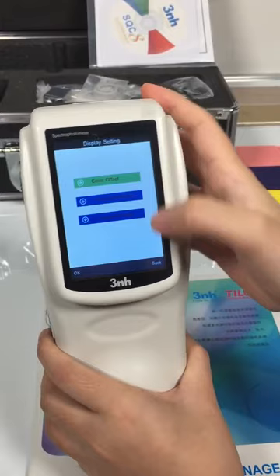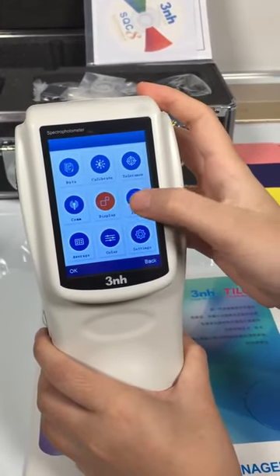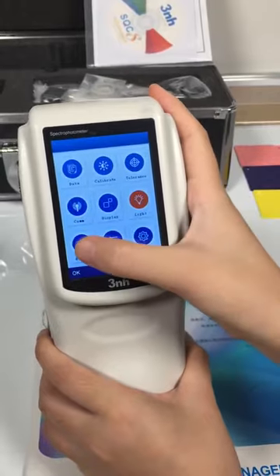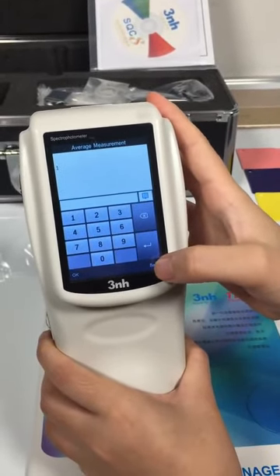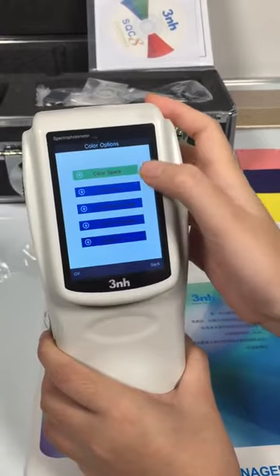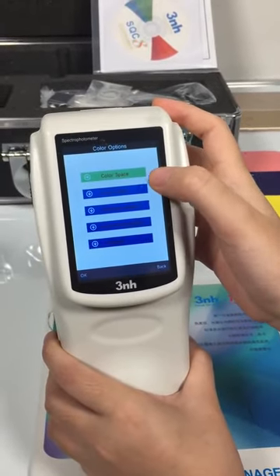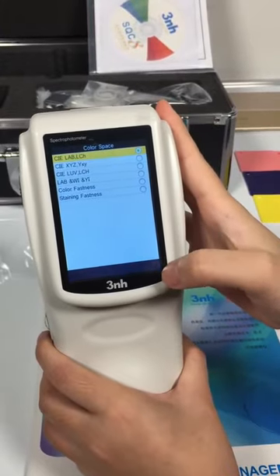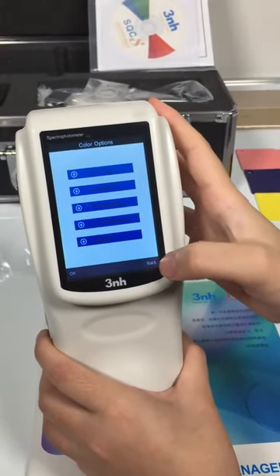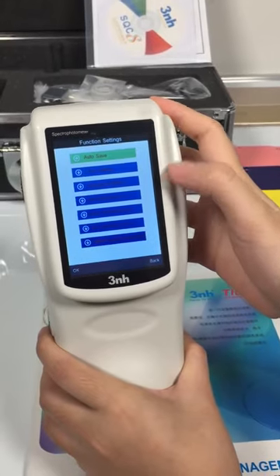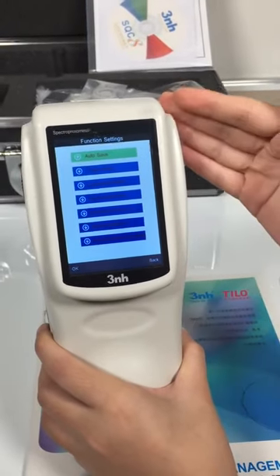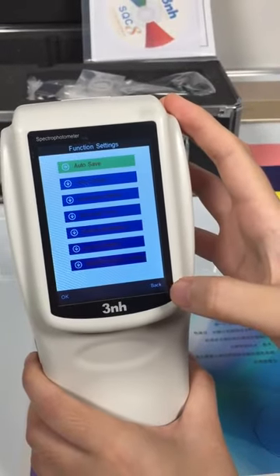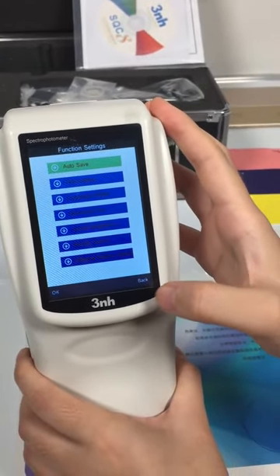Display. Light source selected. Average measurements. Color — we need to notice the color space, you can select it as needed. Setting — this is the setting for the whole machine. That's all, thanks for your attention.